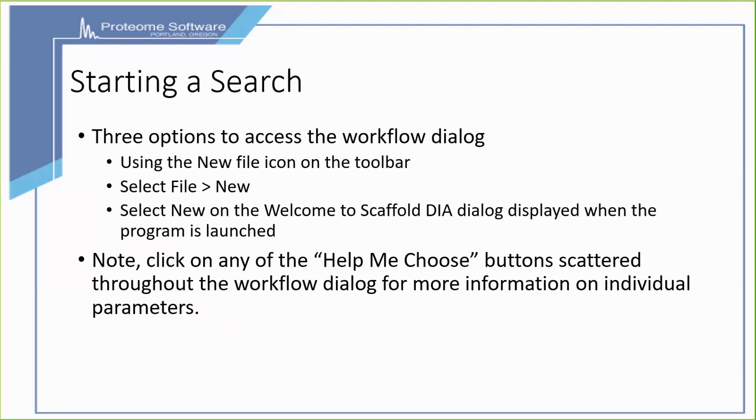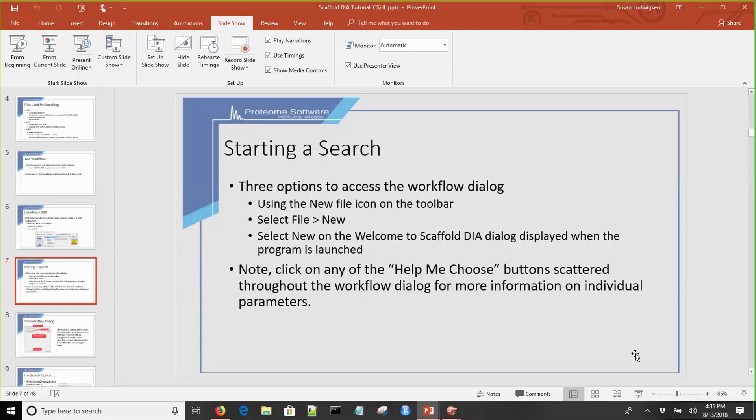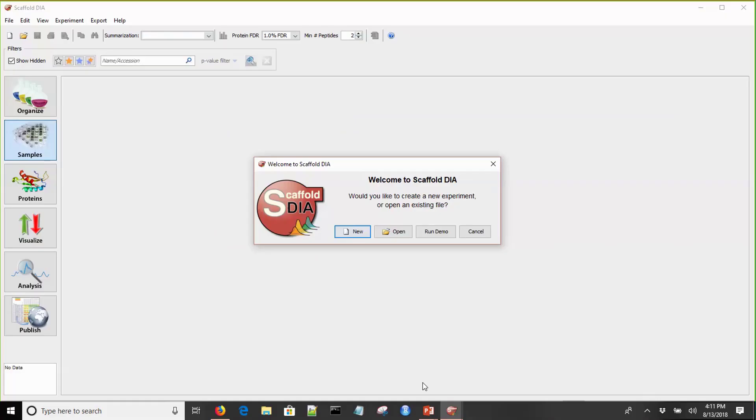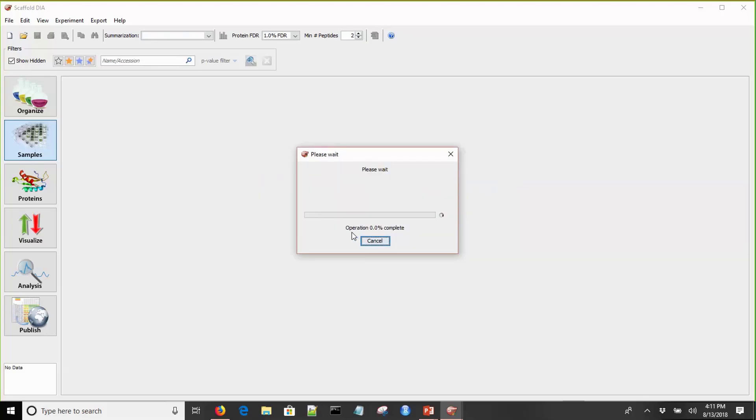Now let's actually go into the program and work through the workflow dialogue. In order to start a search, you have to access the workflow dialogue. We will do that using the New button from the Welcome to Scaffold DIA menu that's available when the program launches.